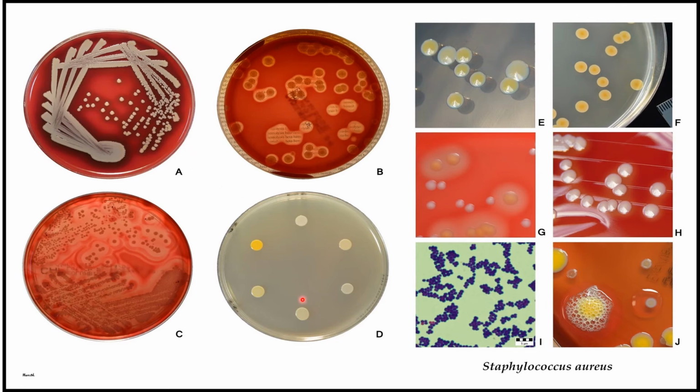And here, sometimes they lose their pigmentation through time. Okay. Sometimes, when the colony is too old for Staphylococcus aureus, they begin to develop more pigmented colonies. Okay.